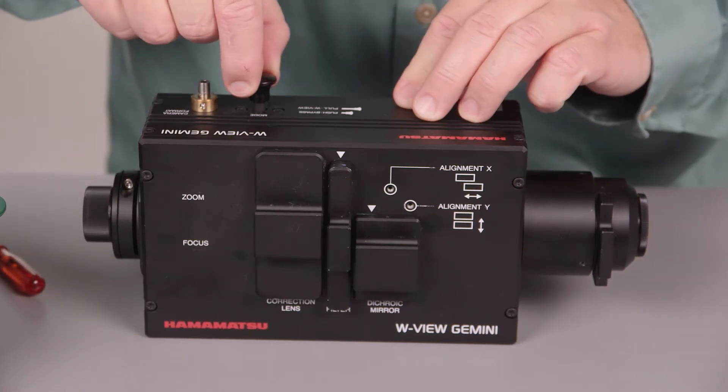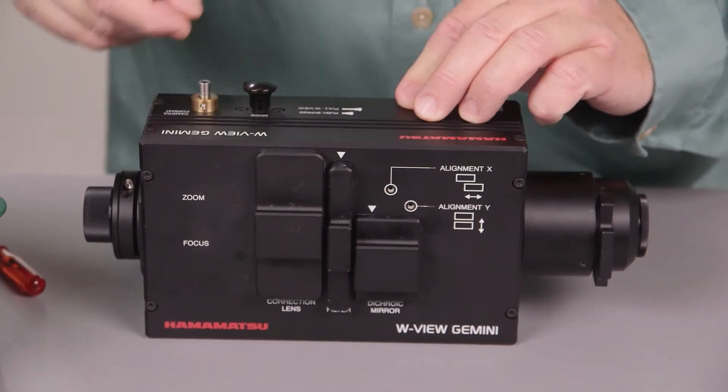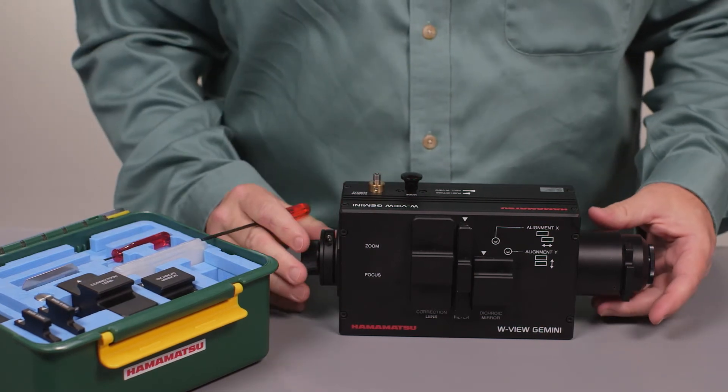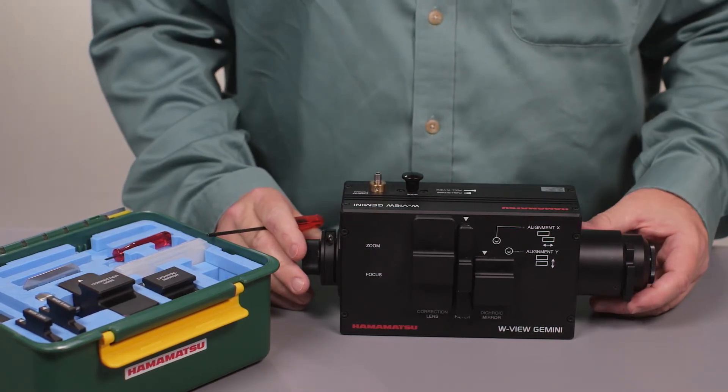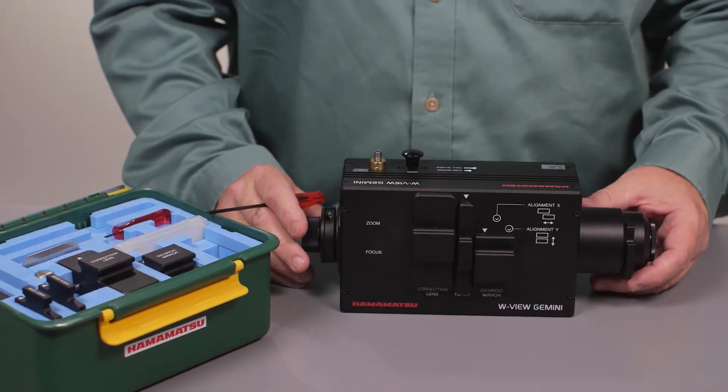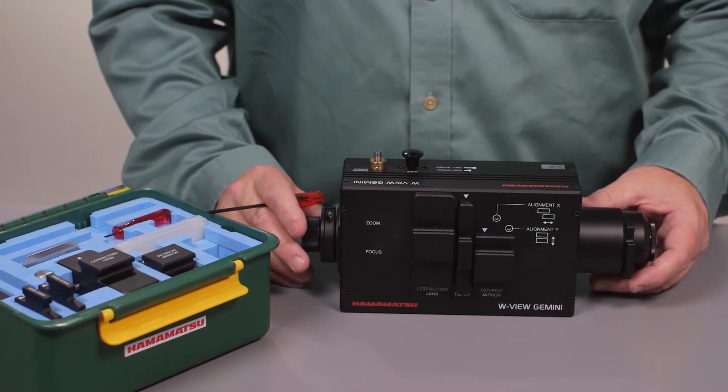The last step is to take this knob, push it in, and now this is in Bypass Mode. Optically, it's as if it were not here. You'll find that the transmission of this is 96%, far higher than the competition, so there's almost no light loss at all.